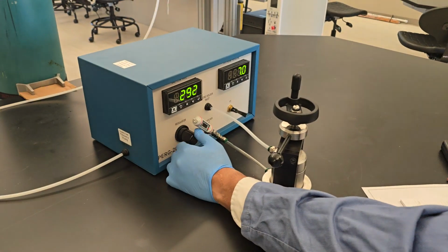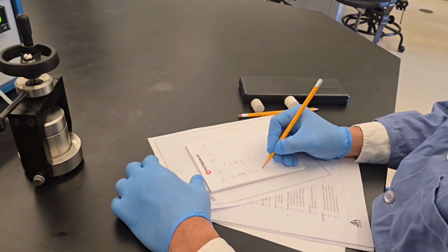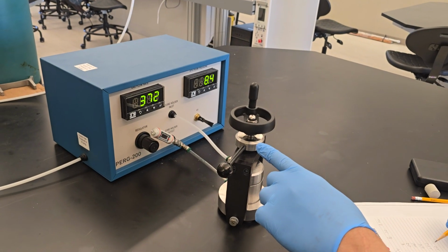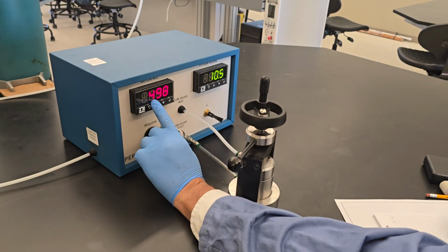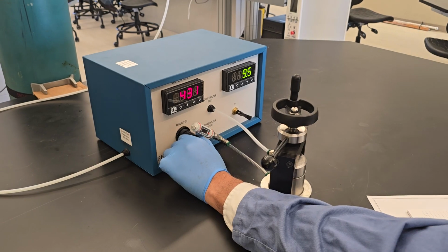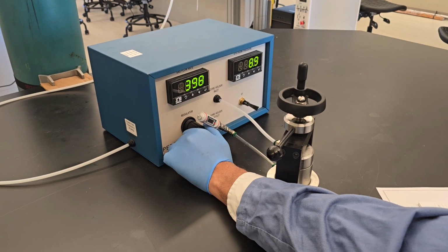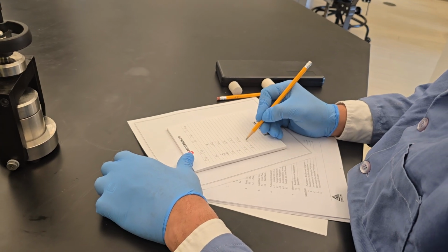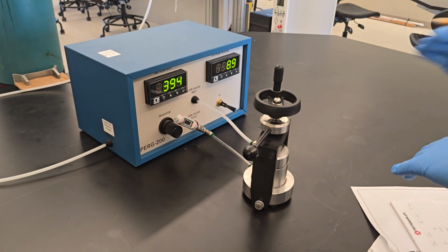Okay, let's take 1 more data point. Okay, got 8.5, 372. You can see you don't want to exceed this to go red, which is exceeding 400. So I'll go a little lower. Okay, so you have 8.9, I got 395. Okay, what I recommend is after that you try to get more data points going down.